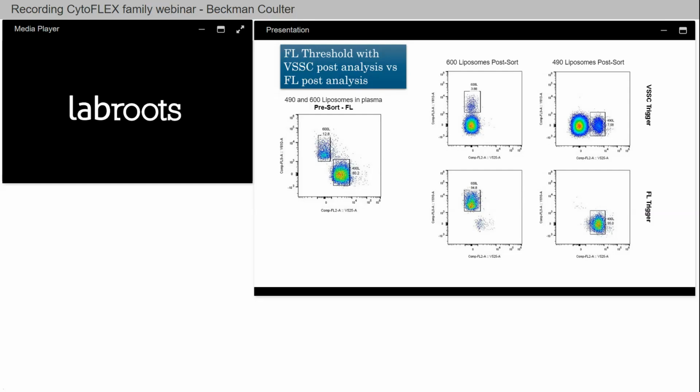Hopefully that does make sense to everyone, because it is not the easiest concept to think about when you're thinking about limits of detection and this background dark noise that is created by the instrument itself from the APDs, the heat dissipation from them, and also just how it's having to produce that signal. And so you get just a lot of background, right? Like I said, totally different than when we do conventional flow cytometry, because we're not worried about the lower end, so we never see it.